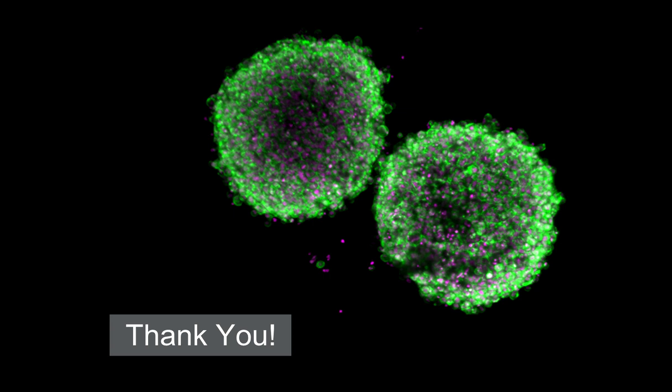They're not attached to anything, so we need to be a lot more gentle with our pipetting and with our media changes. Or as you see here on the final slide, we actually ended up with two spheroids in one well because of a more aggressive washing.